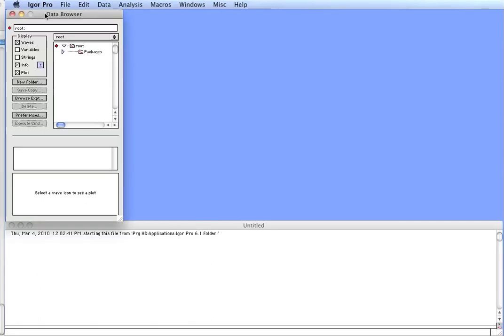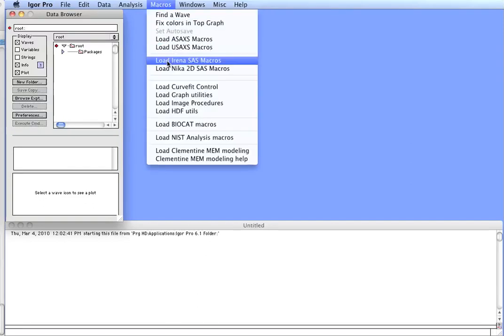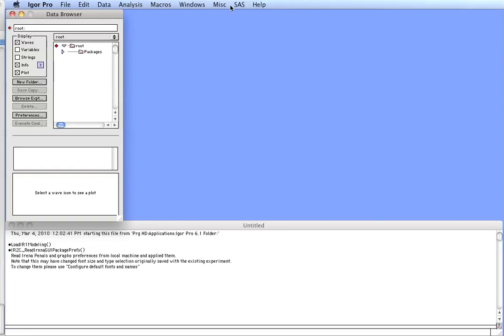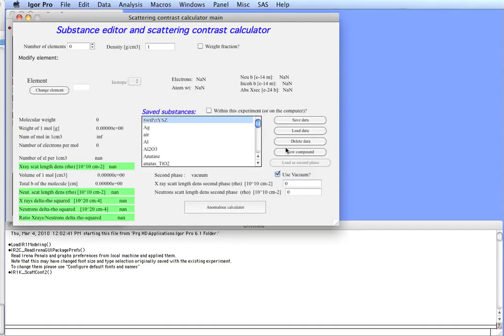This movie will show you how to use X-ray and Neutron Contrast Calculator in IRENA package. First, let's load in IgorPro the IRENA package. In Macros you find the command load IRENA SAS macros. Select and wait until the IgorPro compiles. This will add an SAS menu in IRENA package in IgorPro, and here we can select Scattering Contrast Calculator.